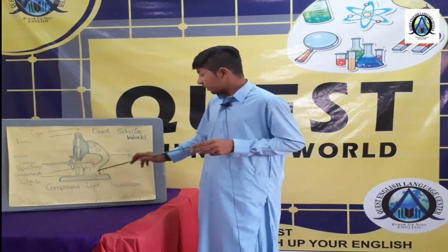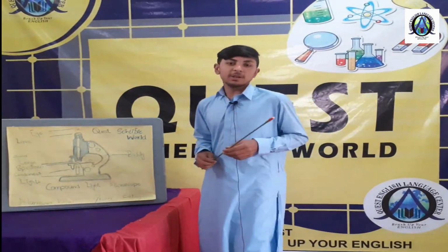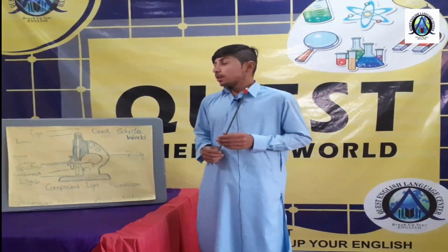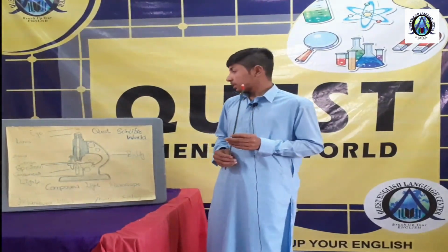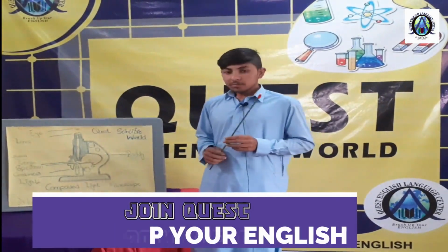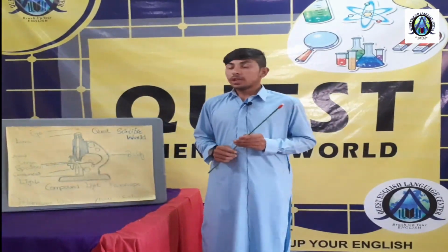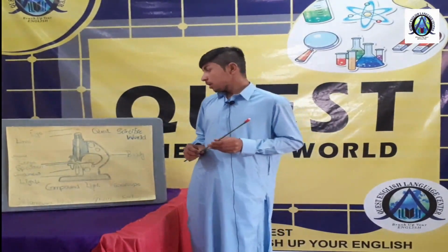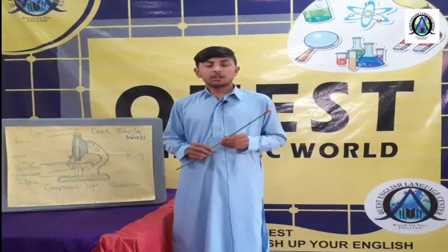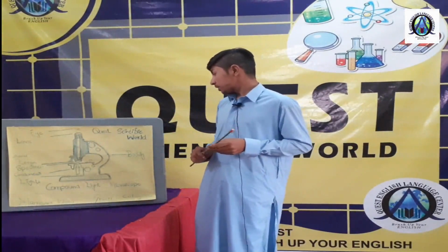It is all upon its body, and it is not that heavy, so it can be carried by someone. The compound light microscope has one more benefit: it can see animals which are alive. It can see the image much bigger than it is, and it can see things larger than 0.2 micrometer, which is very helpful for our modern science and technology.